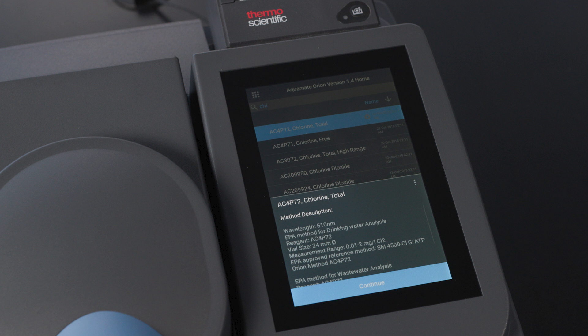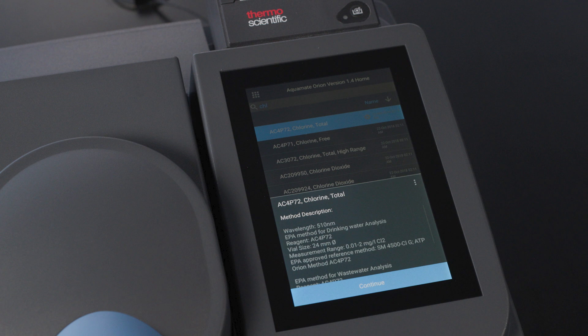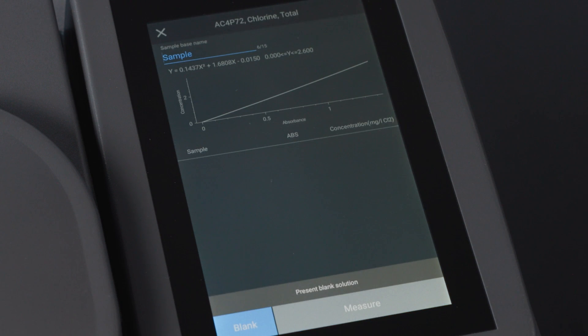We can see that the wavelength is 510 nanometers and that the method is EPA approved for drinking water and wastewater. We can see the reagent number again, the necessary vial size and the measurement range. There is a lot of detail in this screen. Once we've confirmed that we have the right method, we can select continue.